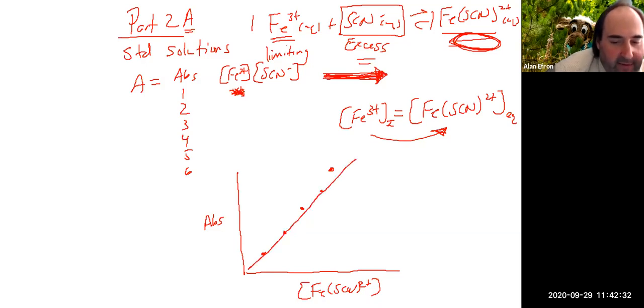And it's going to give you an equation of y equals mx plus b. So very similar to what we've done before. We're going to make this standard curve. And this is only for the test tubes that are in part A, as you're going to make this standard curve for. Now, in terms of how you get that information, there's 2 ways you could get that information.